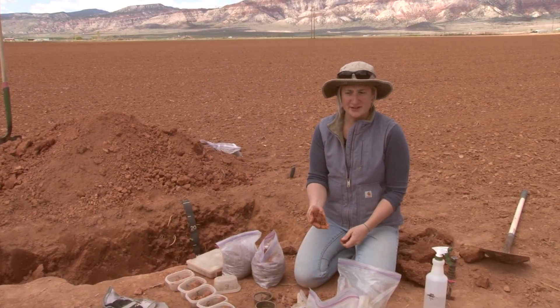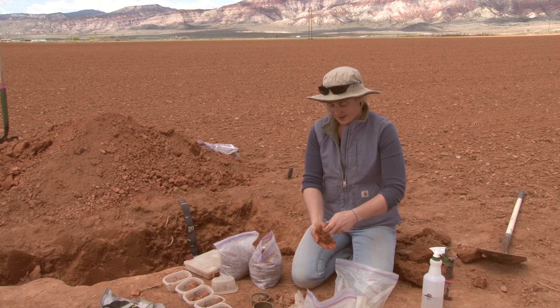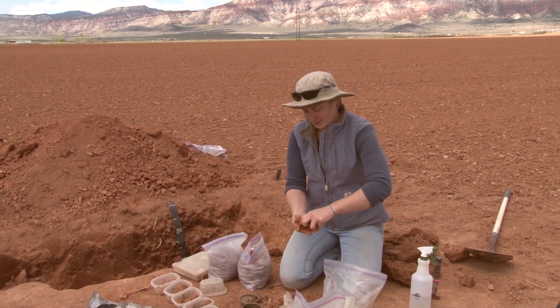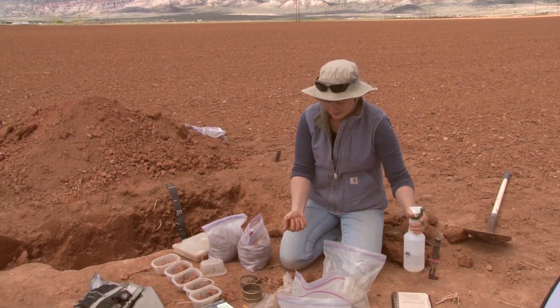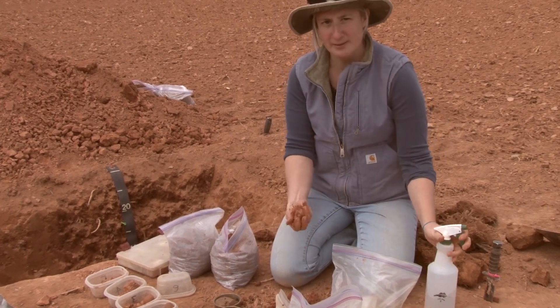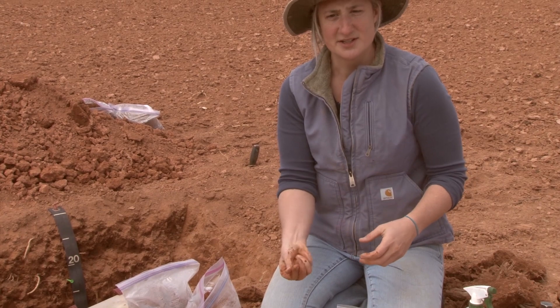I'm going to texture another sample here that's a little bit different than the one we just did previously. This one has some good structure to it. So to help make it easier to texture, first I'm going to break it up as best I can in my hand — that way it's a little more consistent of a material. Just like before, I'm going to wet it up. I already know it's probably not going to be a sand because of the material holding together into those clods.